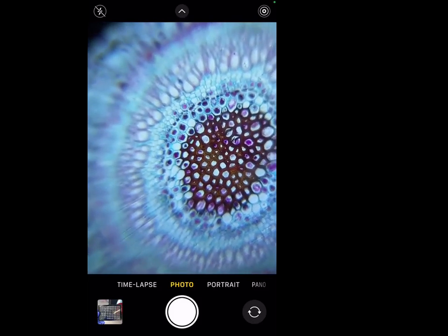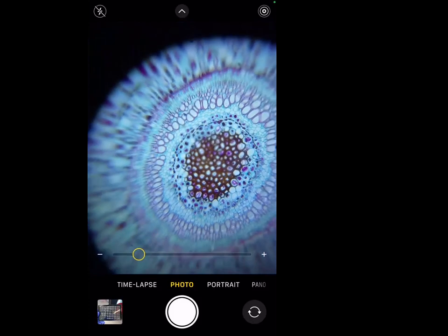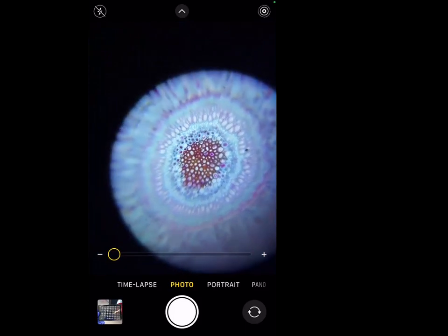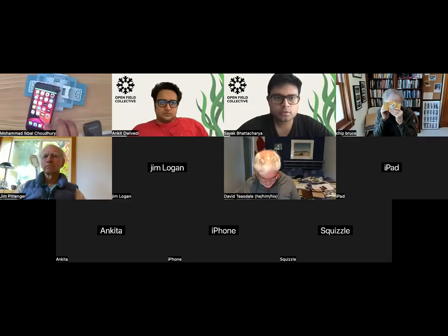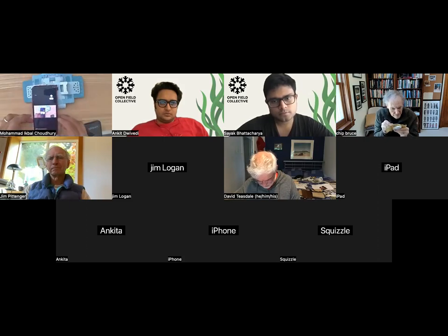Can you see? Right at the center, because I have zoomed in quite a bit, so I have to move tiny bits here and there to focus each individual section. So I'm focusing. Can you just remind me how you focus? Which bit do you press down to focus? Yes. So let me just, can you switch to this camera side, one that is overhead? Yeah, you have to stop sharing screen. I think I have done spotlight on that, so it should be okay. Let me see. Yeah. Okay, so the question is, how did I focus, right?